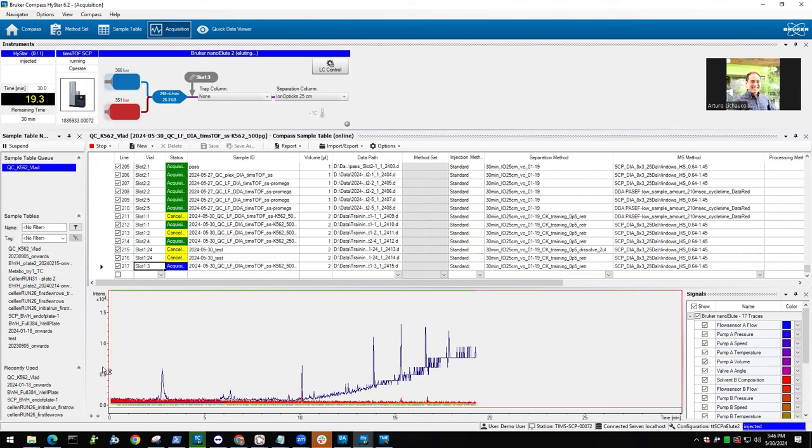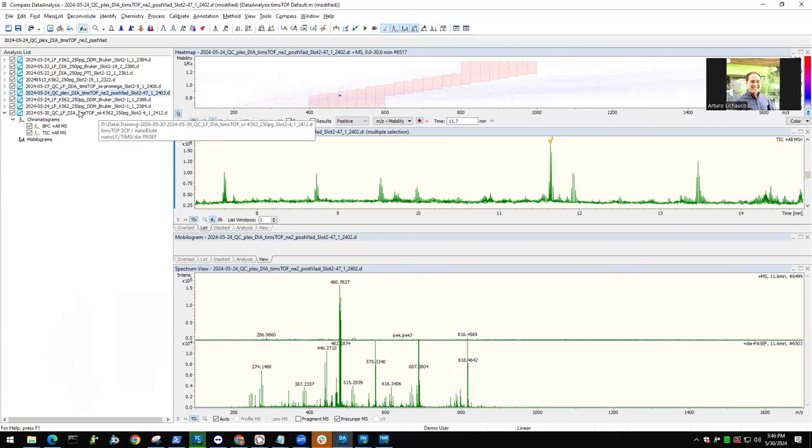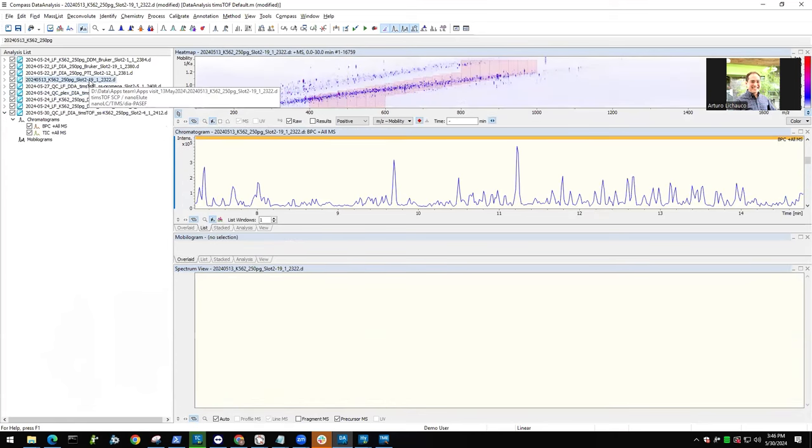But yeah. Do you have any other file? Yeah, that was what we were looking at here. On Friday, it was running, so they ran samples on Friday, but today it doesn't like to take the sample. It's taking the sample, but I'm not sure if the sample is not making it to the column or something else was wrong. But yeah, let's see. Anyways, I think I've talked enough.